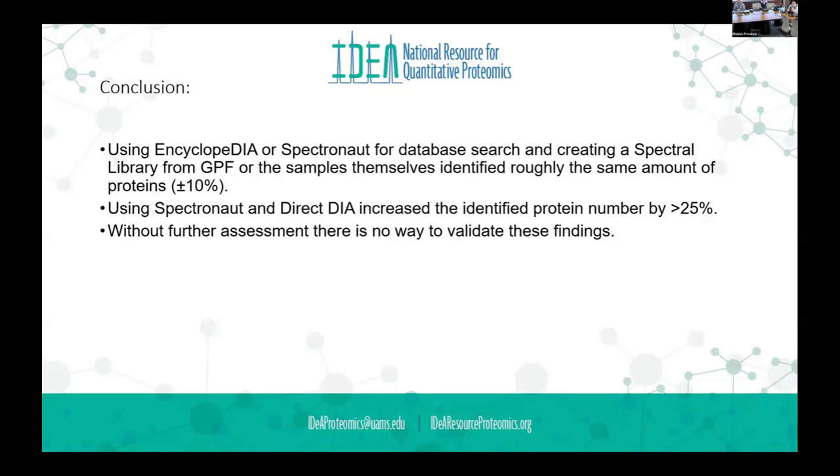One of the things I'm often struggling with is that it provides imputation, right? And one of the things you're looking for in DIA experiments is completeness of data. And so it's not perfect though in my hands, like you still have missingness. I mean, you can turn it on or off. But you don't have to use it. And there's 3 different ways it does imputation. That's right.